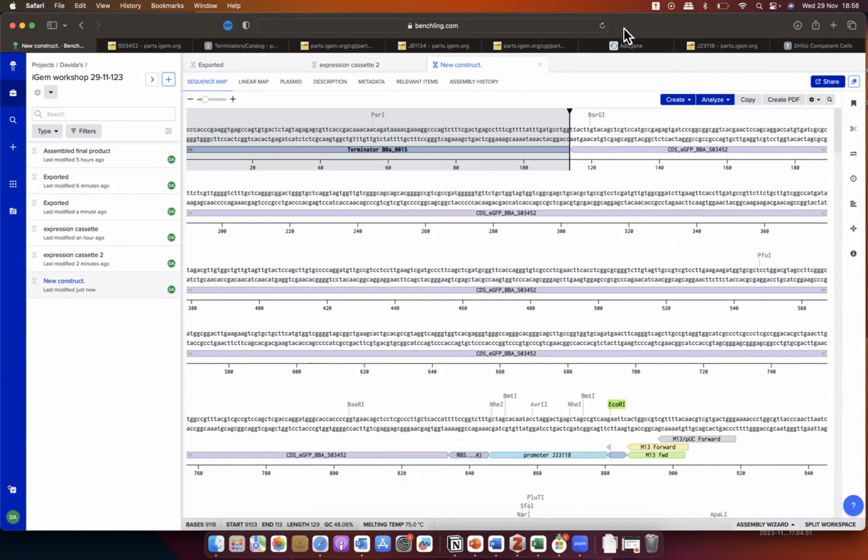While people come up with their own questions, and of course, questions can range from things specific to the workshop to things that you are particularly interested in, that you would like to know if you can use these databases to apply to your own research and to your own interests. So just ask around, ask anything, and whatever can be answered, I'm sure David will do his best to do so. I actually had a question myself related to the registries.